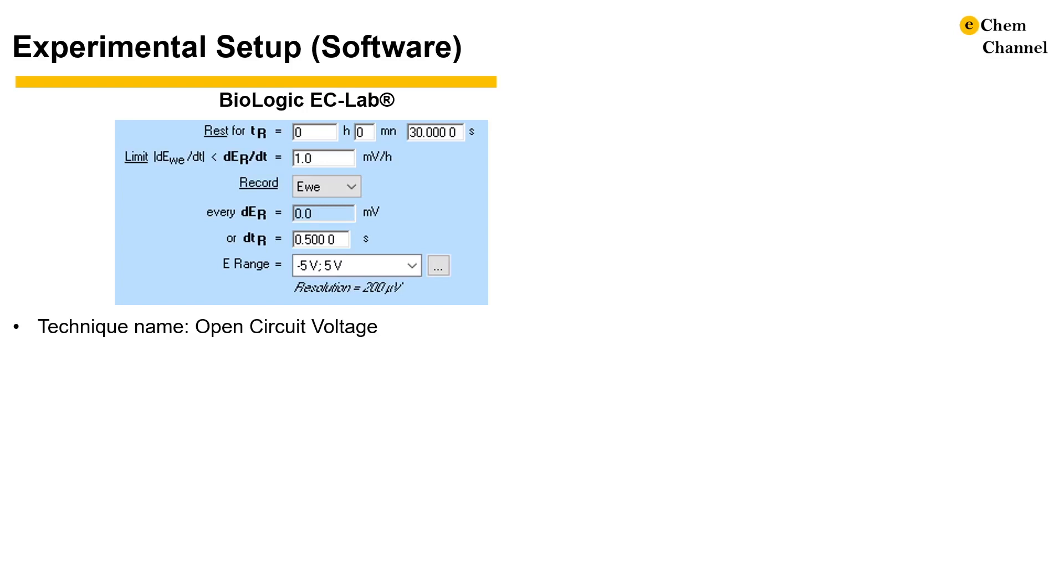I'm more familiar with BioLogic's ECLAB software, so I'm going to use it as the main example. In this software, you need to add a technique named Open Circuit Voltage, then you will see a typical setup page that looks like this.